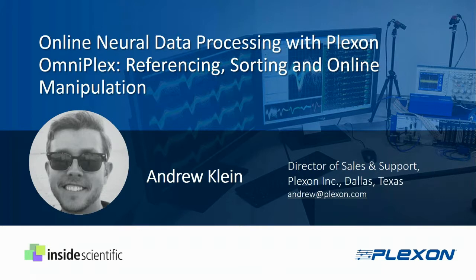Today's webinar will focus on the fundamentals of OmniPlex software, a turnkey acquisition and data management platform for recording neural biopotentials from acute or chronically implanted electrodes in both anesthetized and awake behaving animals. The presentation will be led by Andrew Klein, Director of Sales and Support at Plexon.